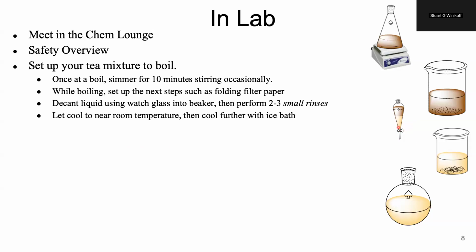Now, in that beaker, you're going to need to let that solution cool to near room temperature. Once you can touch the glass, then you're going to want to place it into an ice bath to cool it down further, because we want this to be nice and true room temperature or straight up cold before we place it in the separatory funnel, as the separatory funnel is a confined container, and you never want to have a hot liquid in a closed system.